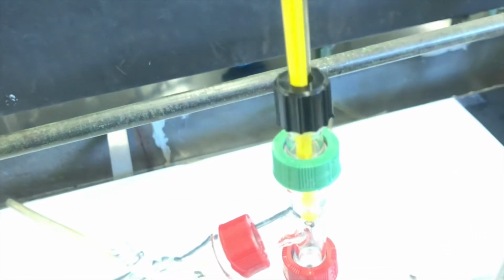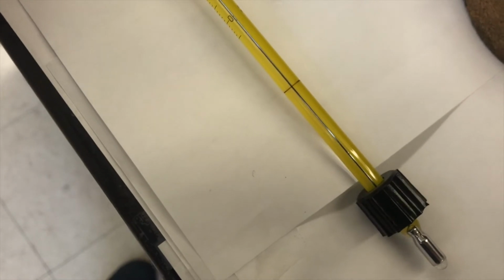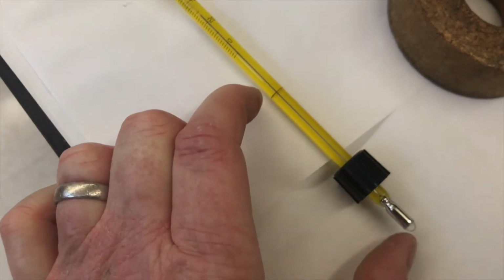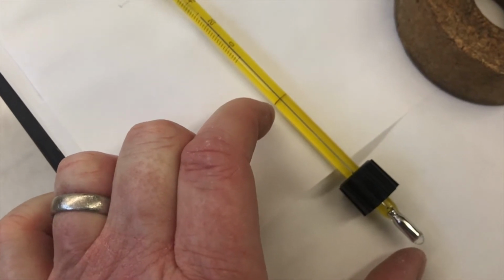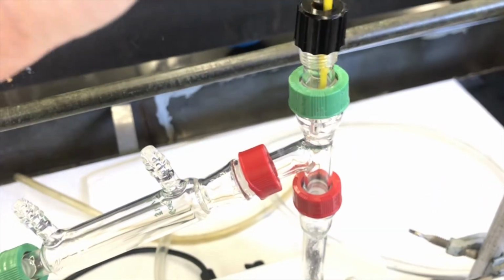And another thing I wanted to point out is our data isn't going to be that great. This thermometer is a nice mercury thermometer. They're actually illegal to buy now in California, but these were bought decades ago, so they're legal to own but not buy. So anyways, we have these mercury thermometers, and this is an immersion thermometer. Can you see that brown line? Let me bring it down here. Can you see the brown line right there? That brown line is the immersion line. So to get an accurate temperature, you should have this thermometer completely in a solution or vapor of a gas to that brown line. Not above it, not below it. And we're not going to have that perfectly here, so our temperature values will have some error, but that's okay.